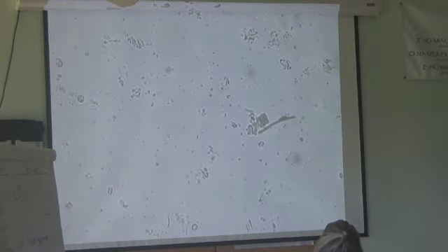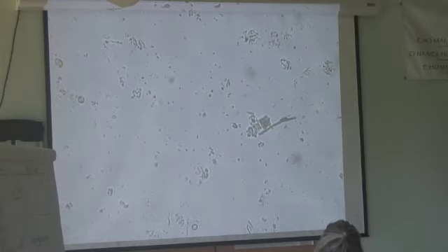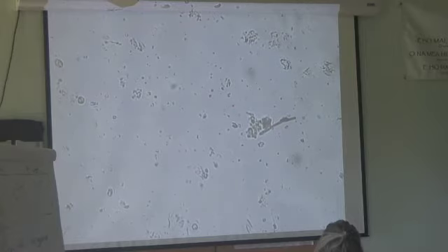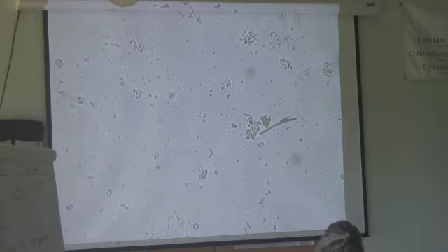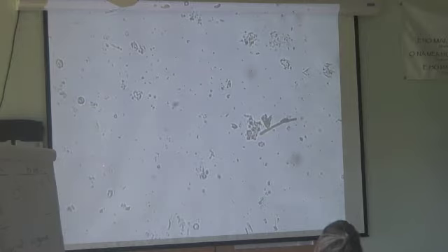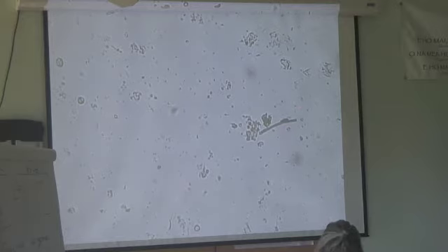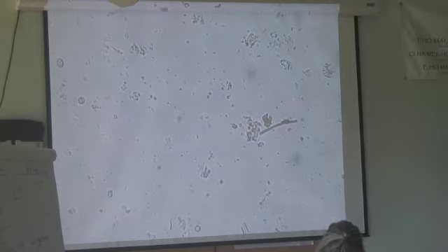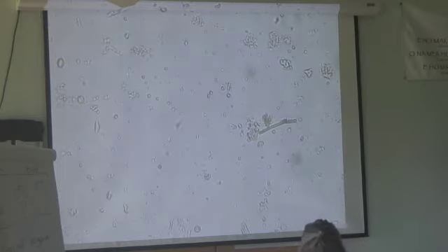We have some really small cocci. We have a little bit larger cocci. We have a little bit bigger. We've got a spore something there. We've got a rod-shaped bacterium down there. So it's pretty good diversity. We've got more than six different kinds of bacteria, but we're a little lacking on the rod end of things. There's a little rod-shaped bacterium right there, but they're a little bit lacking in numbers. So, you know, a little improvement there would be good.